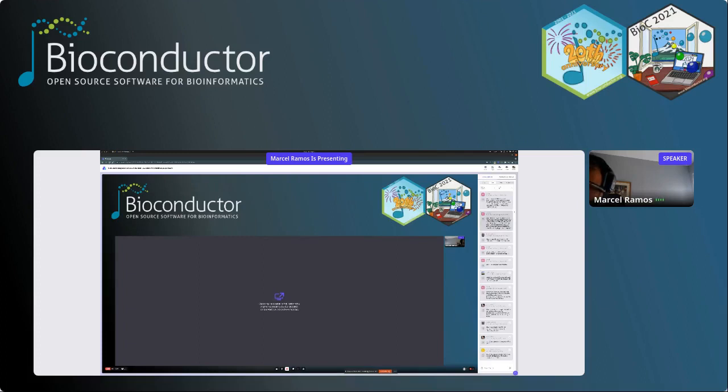Does MultiAssayExperiment only work with TCGA data through cBioPortal? Say I have a batch of tissue samples, I have RNA-seq, and... Yes, it doesn't only work with cBioPortal data or curated TCGA data. You can create your own MultiAssayExperiment, as we saw in our tutorial. So you would have to provide the experiment list, a colData, and a sample map to coordinate the row names in the colData and the column names in all of the experiments.